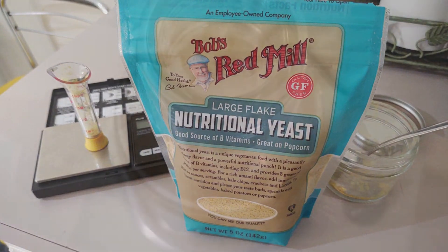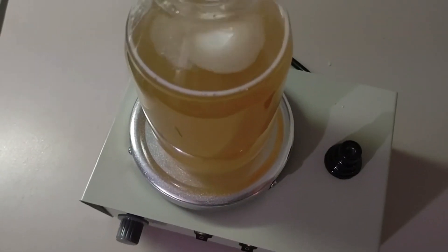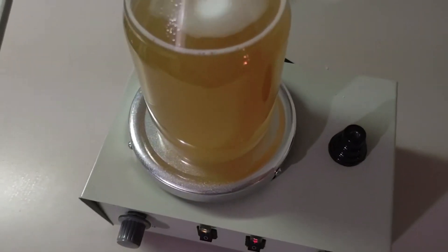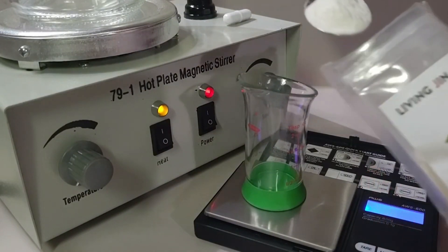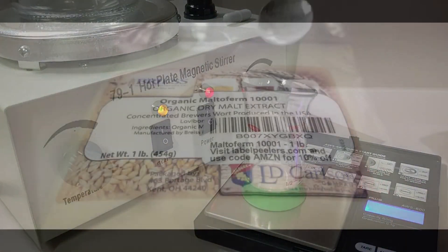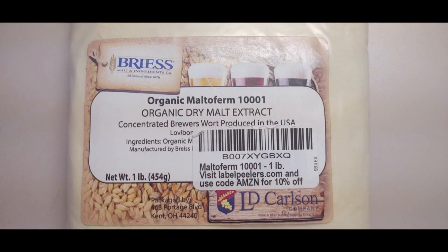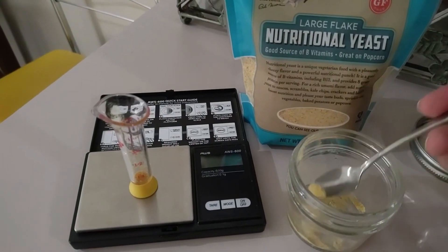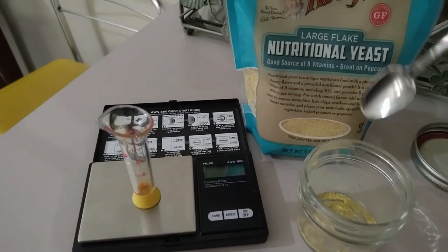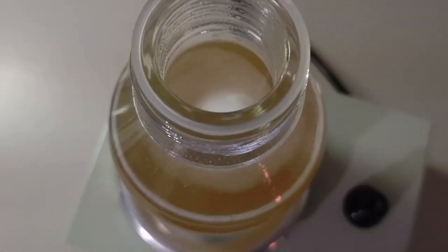We experimented with many different recipes and we really feel like we've perfected this one. So when creating 500 milliliters of agar, you want to use 10 grams of agar, 7.5 grams of malt extract, and 0.25 grams of nutritional yeast. Yes, that's 0.25 grams of nutritional yeast to create 500 milliliters.